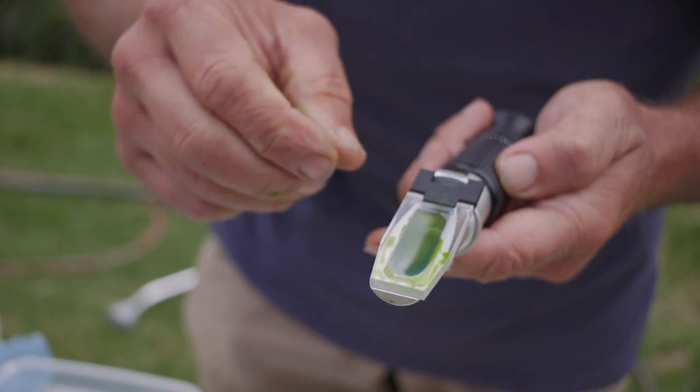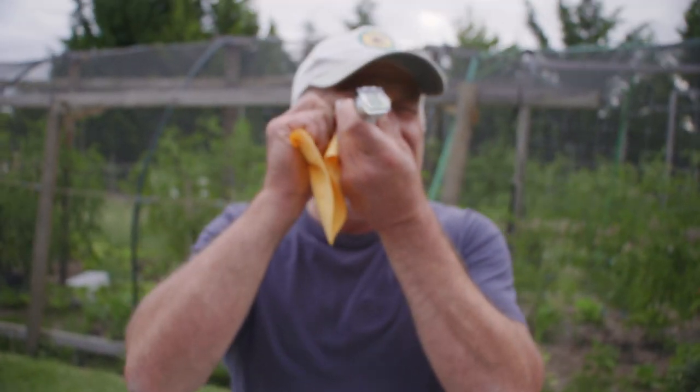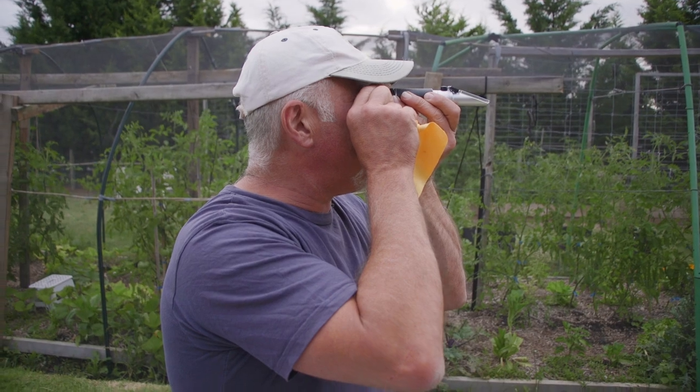We just drop the lid over the top. It smudges all over that plate and I'll have a quick look in here and see what's going on. So this is the new growth and it's sitting at 10.